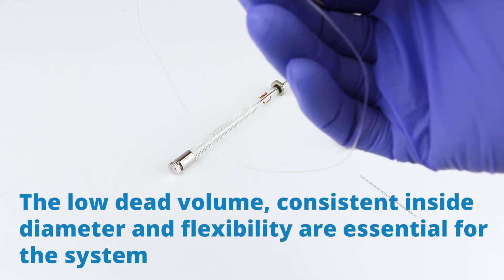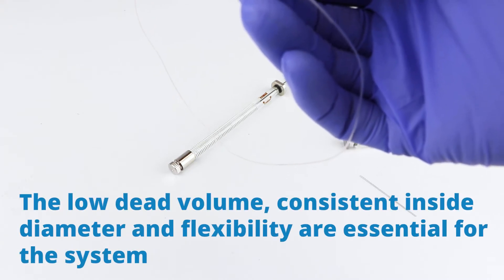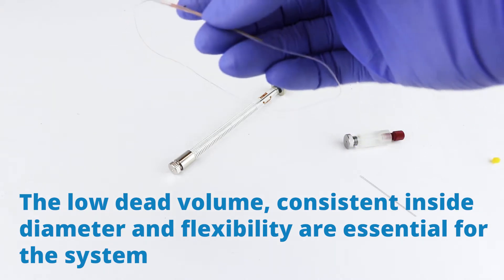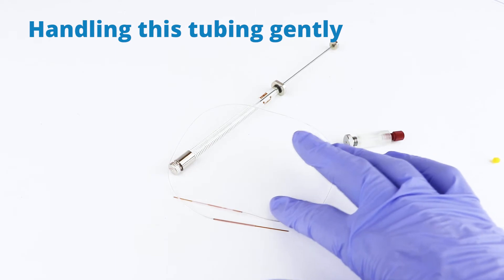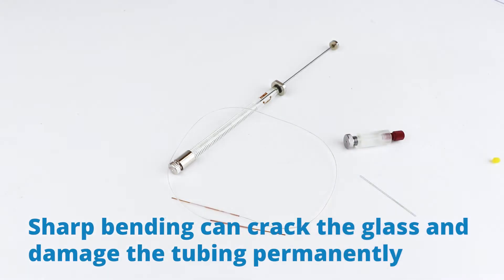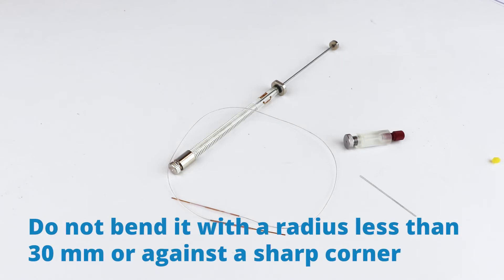The low dead volume, consistent inside diameter, and flexibility are essential for the system. Handle this tubing very gently. Sharp bends can crack the glass and damage the tubing permanently. Do not bend it with a radius less than 30 millimeters or against any sharp corners.